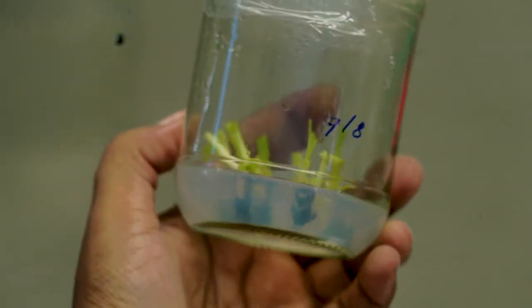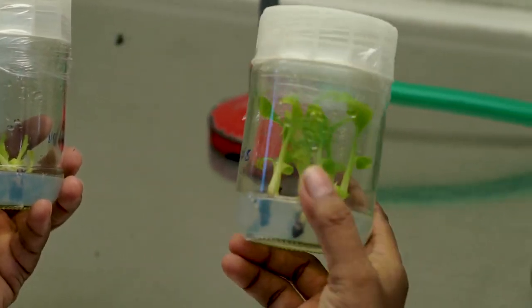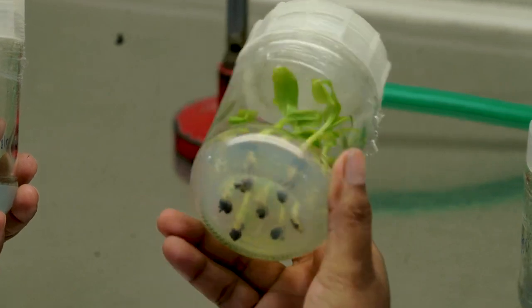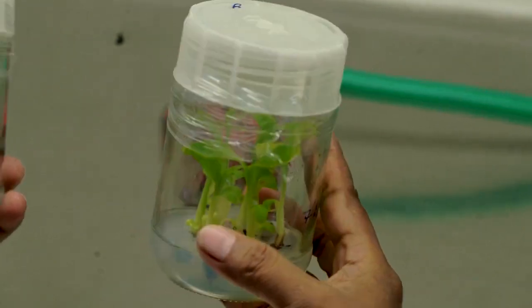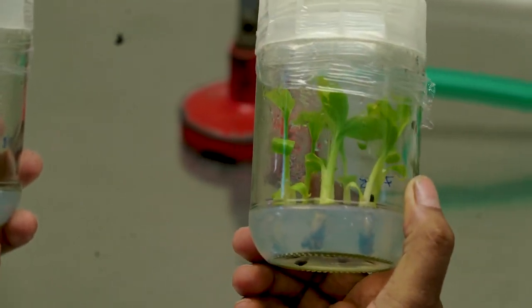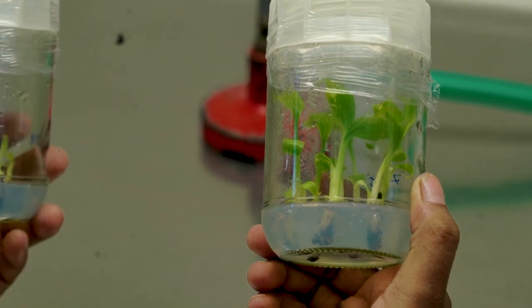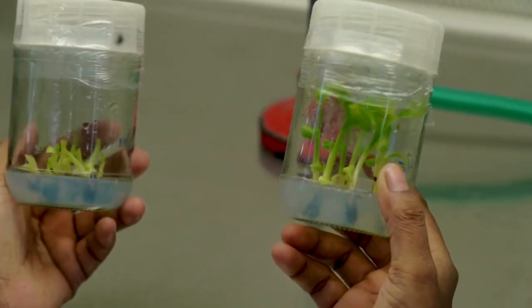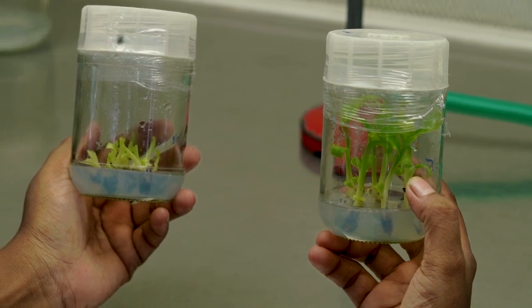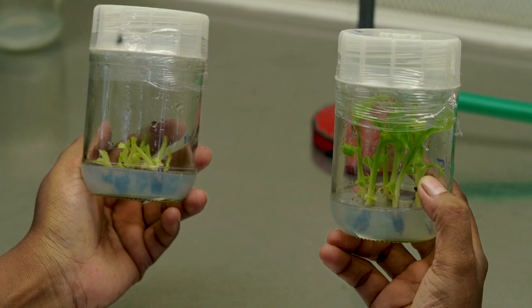Whereas on the right hand side, you can see the plants which were transferred into rooting media. As the plants do not contain any roots, we have transferred them into rooting media. Rooting media will help in the regeneration of the roots. Once we get sufficient roots on these plants, they will be transferred into potting mixture.